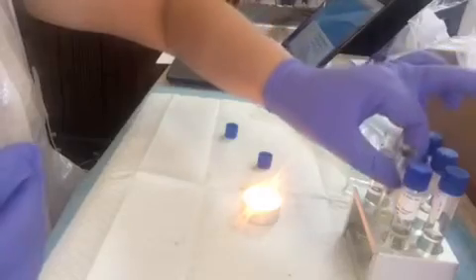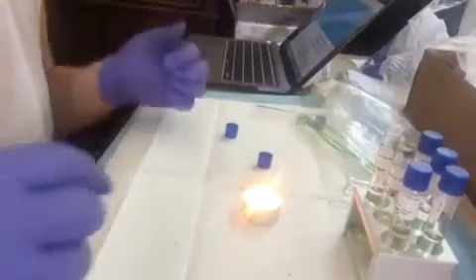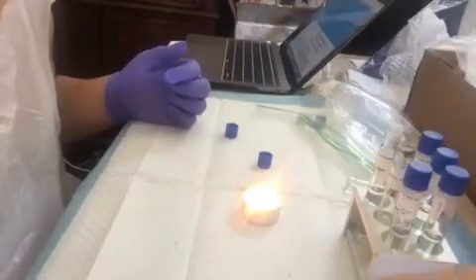Now we're going to use a pipette that was soaking in alcohol. Just going to get 2 drops of the S. cerevisiae and place it in the broth.